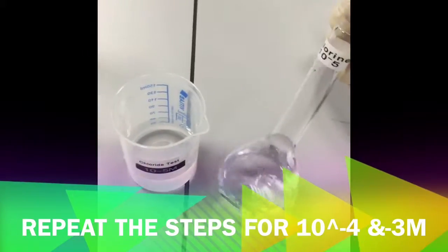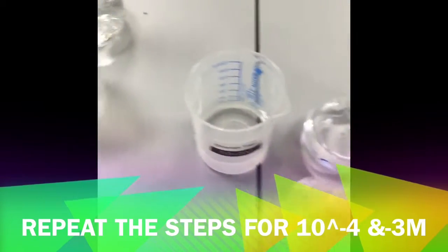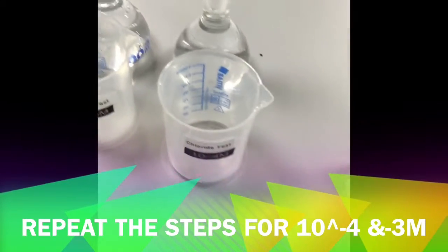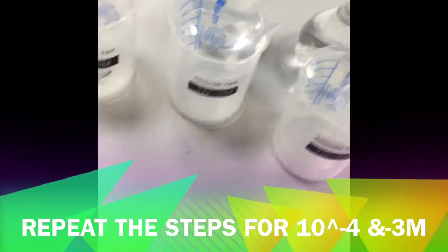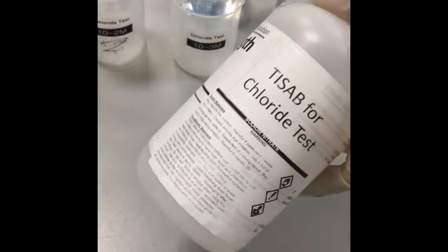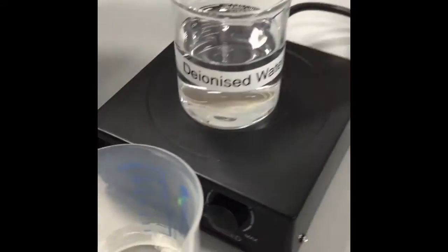So do the same thing as what you did for the 10 to the power negative 5 molarity. Repeat with 10 to the power negative 4 and negative 3: pipette 50 ml each individually, and 1 ml of the ionic strength adjuster into the small beaker for the chloride test. Please ensure that the ionic strength adjuster is only for the chloride test, as you can see from the bottle here. In assignment 4 we'll be using the ion selective electrode.